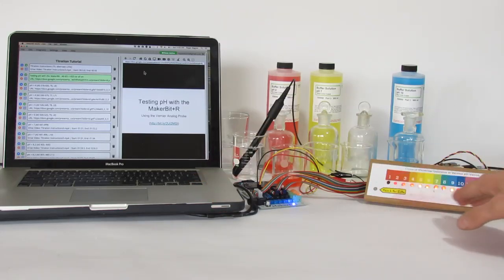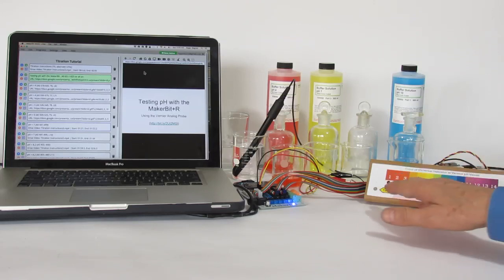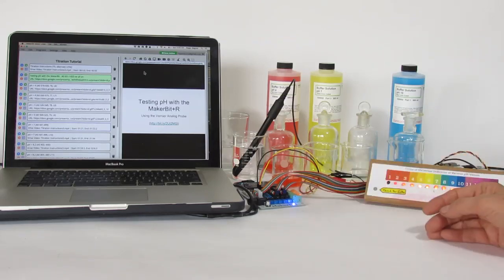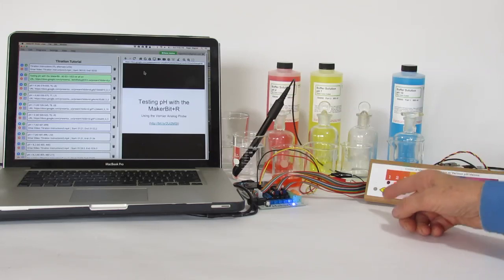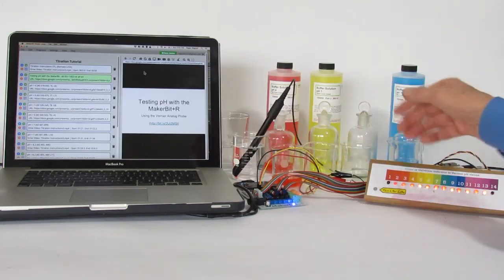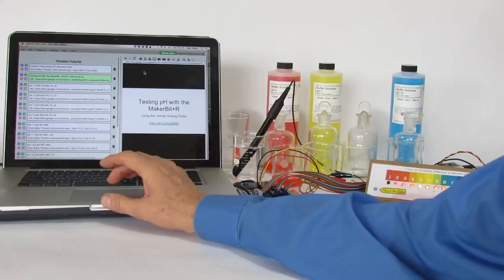Over here we've got a little display set up with LEDs. The MakerBit can control those, and as the pH changes those lights will indicate the pH as well.